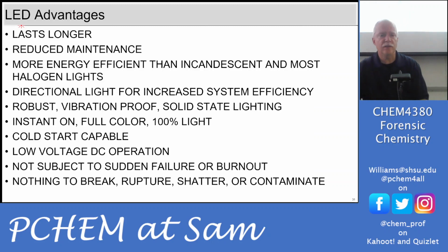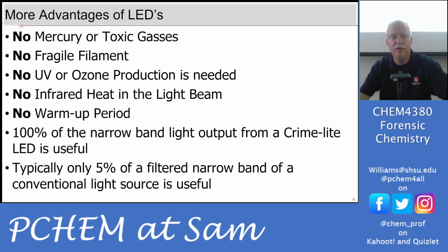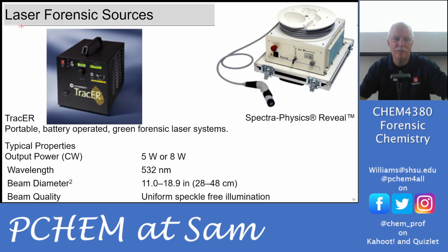They last longer, there's less maintenance. Again, more energy efficient than the incandescent or halogen lamps. They don't have to warm up, so they're stable over time. You turn it on and it's ready to go. It doesn't change over time. And they're pretty robust. You can drop them and not bust it. They also don't have mercury or toxic gases. If you drop it, you're not going to break the filament. It doesn't produce any ozone or anything like that. No warm-up period, so they're really great. That could be a commercial for them.